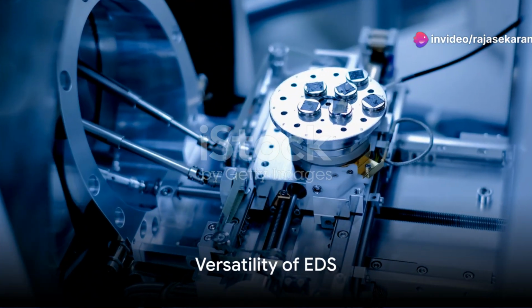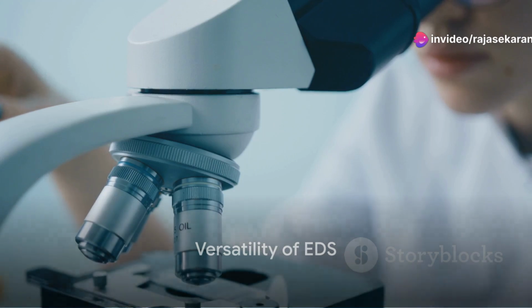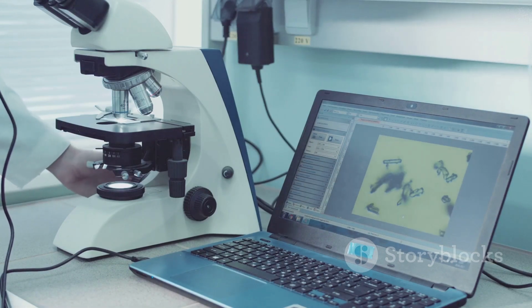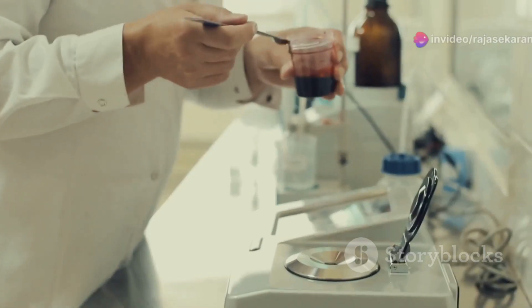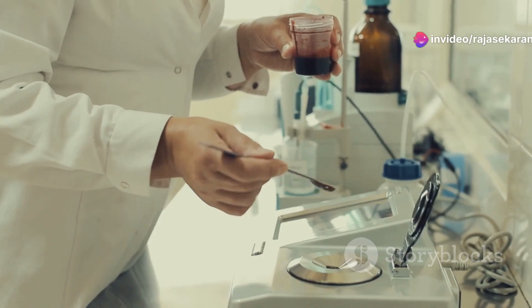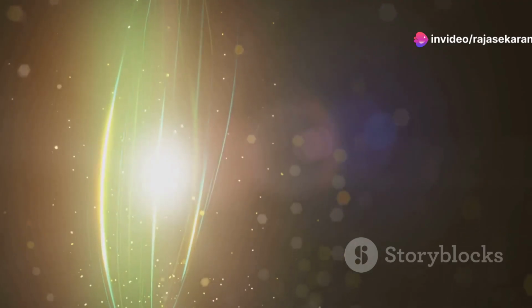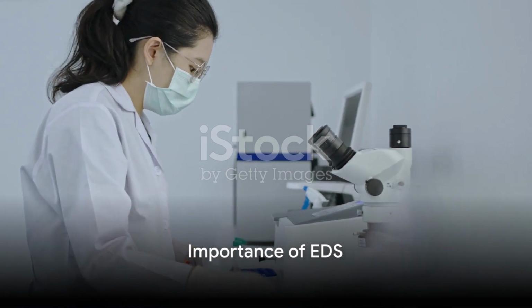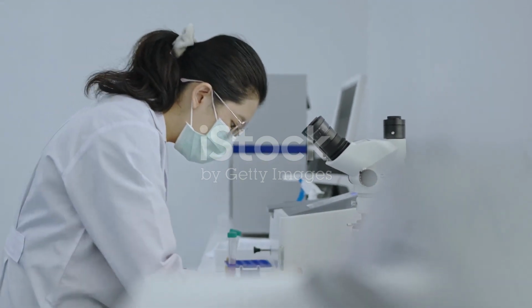Now let's dive a bit deeper. The beauty of EDS lies in its versatility. It can be used in conjunction with scanning electron microscopy, or SEM, to provide spatially resolved elemental information. This means not only can we find out what elements are in the sample, but we can also determine where they are located.